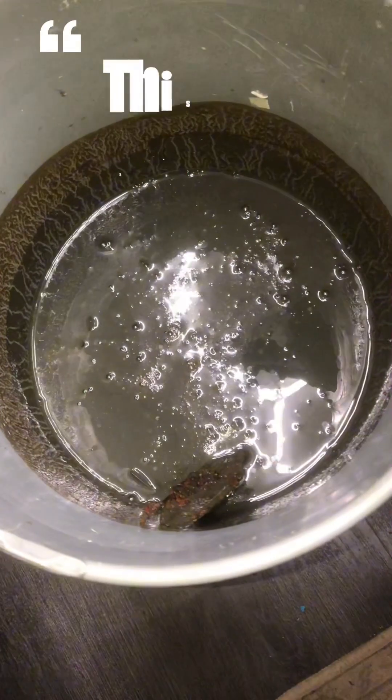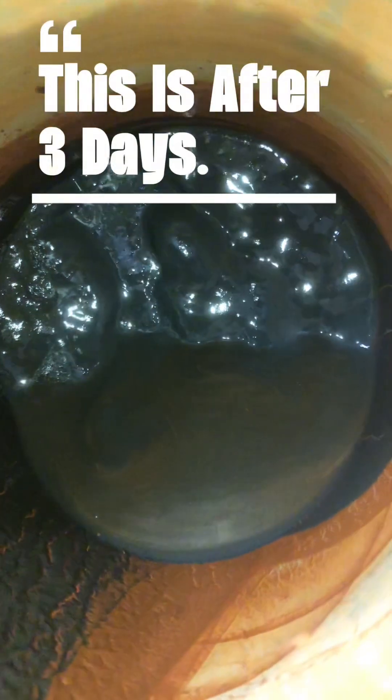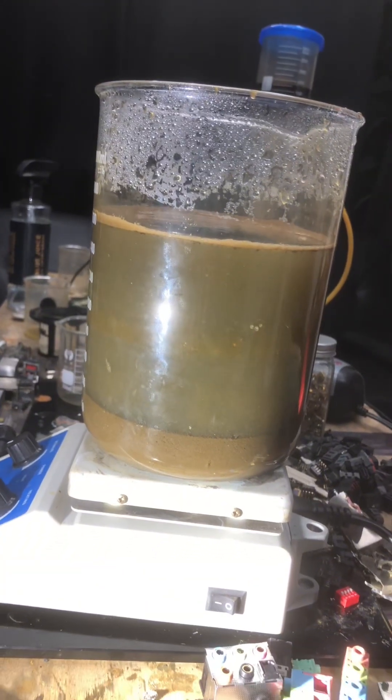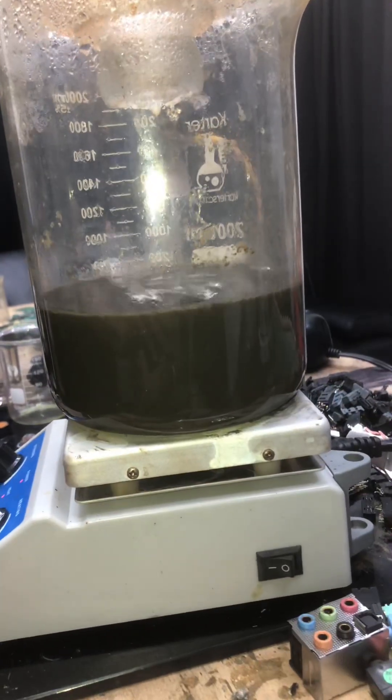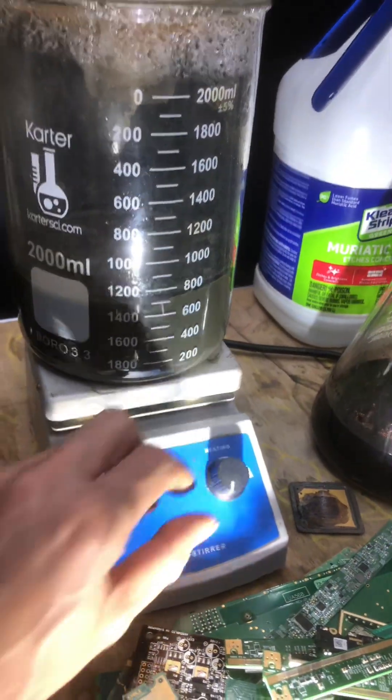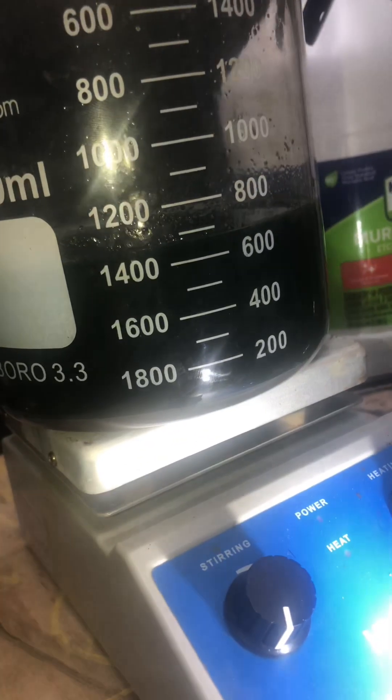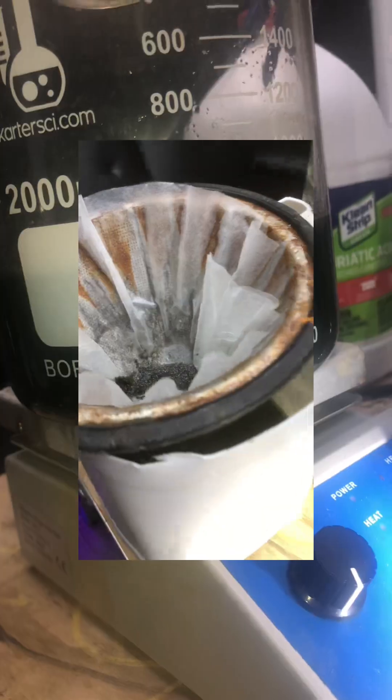Next, transfer into a beaker or jar, then pour off excess water. Add some muriatic acid and your solution should turn dark blue-green. This is because of the copper and other metals in your mix. Filter off excess muriatic acid and rinse with more muriatic acid until your solution turns yellow.